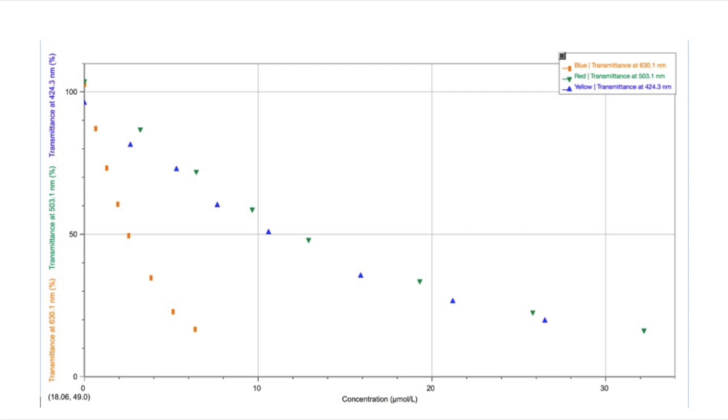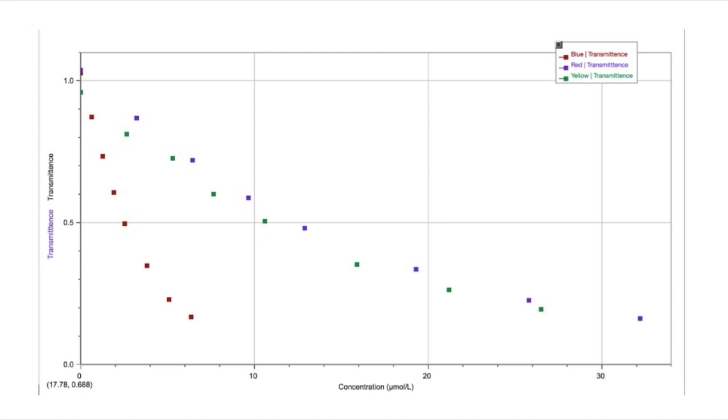Now, what I need to find the concentration of the food dye in the 5 sports drinks is absorbance versus concentration and more of a linear graph. So, I started by converting the percent transmittance into simply just transmittance. So here's my graph of transmittance versus concentration.